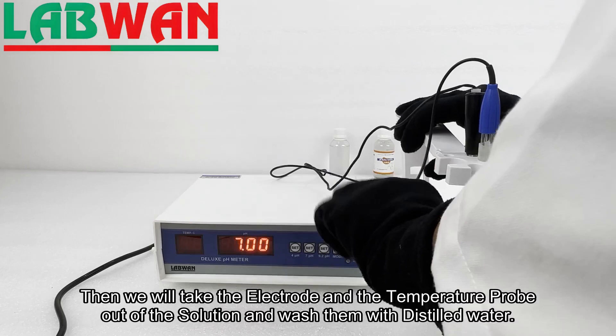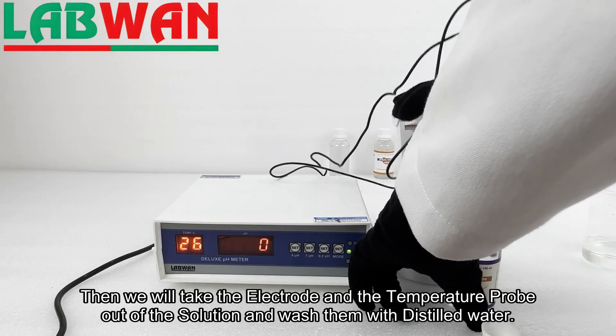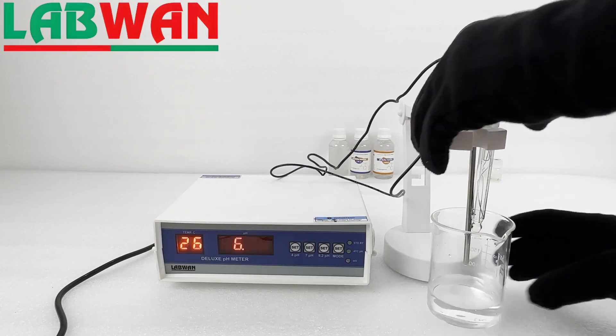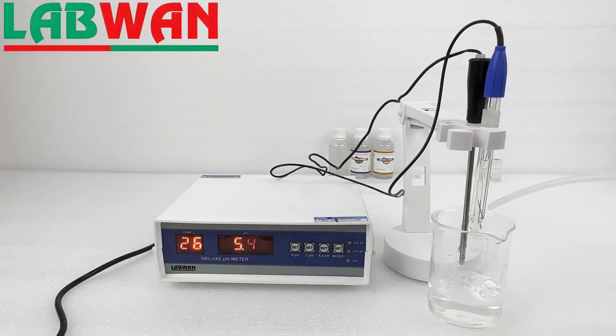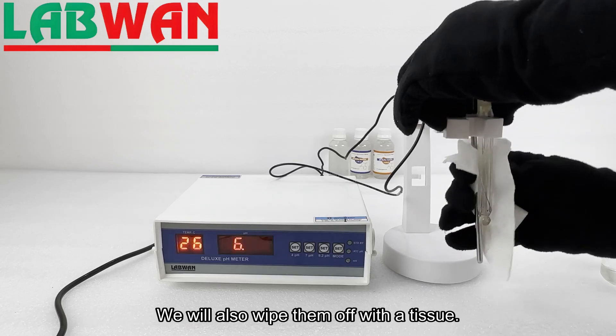Then we will take the electrode and the temperature probe out of the solution and wash them with distilled water. We will also wipe them off with a tissue.